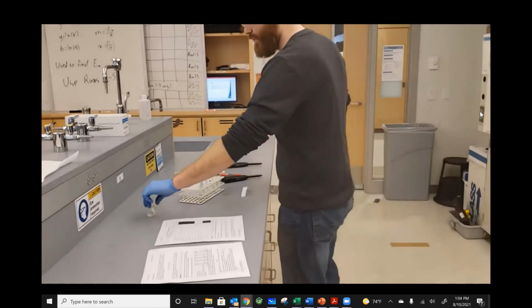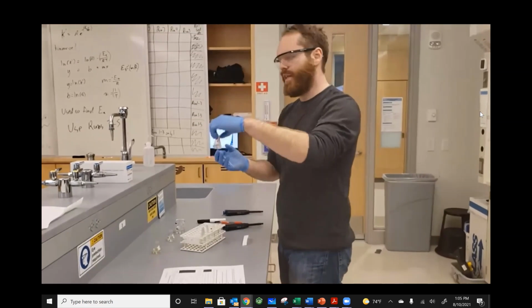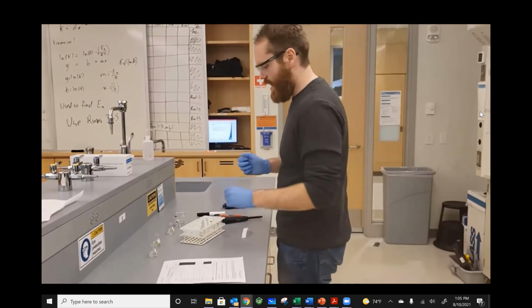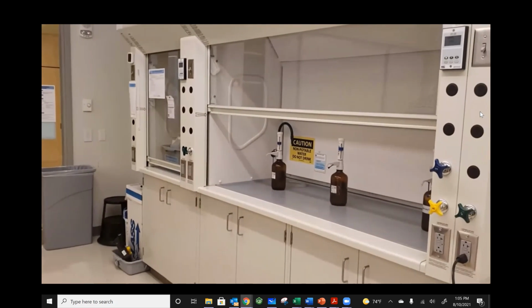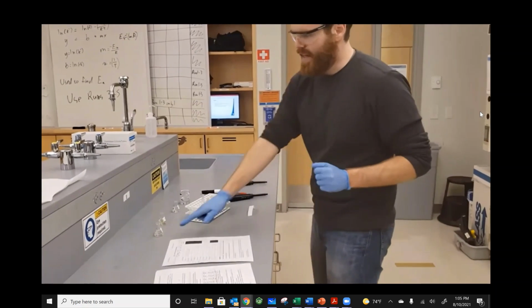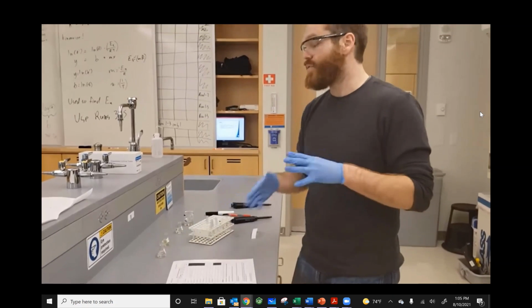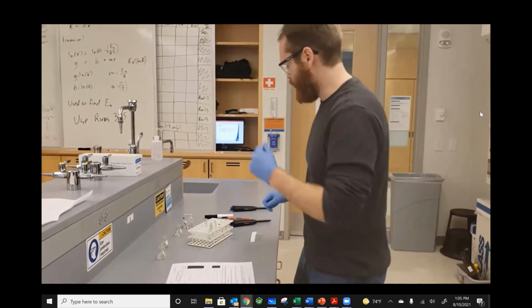Also, another good source of error is hydrogen peroxide itself deteriorates when exposed to UV light. That's why it's always in those nice opaque brown bottles. You don't want to have UV light present to our hydrogen peroxide, otherwise it readily deteriorates. Meaning the concentration that I started with is not currently the concentration in there. Mind you, it's a very slow reaction, but it is a reaction that occurs when exposed to UV light.